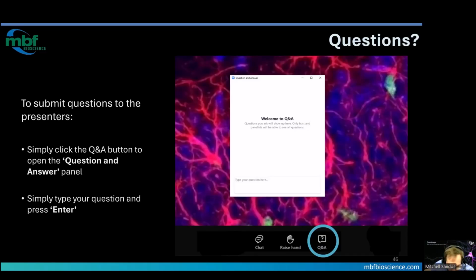This question: if the microscope setup allows adjusting the laser power using a half-wave plate, what would be an efficient way to dynamically adjust the laser power during a tiled mosaic Z-stack acquisition? For example, changing the laser power as a function of depth.